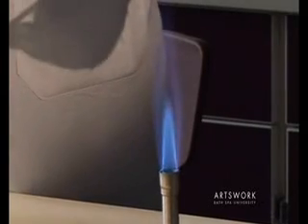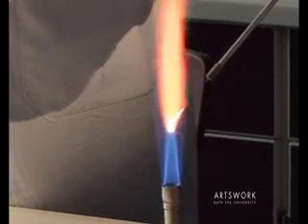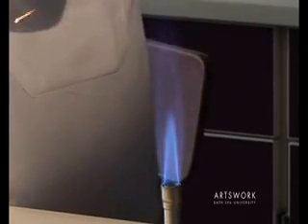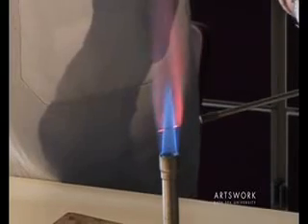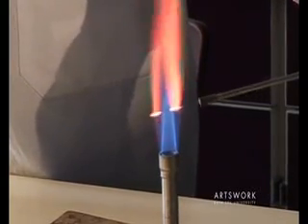If you're using the flame to sterilise equipment, put it directly into the top of that blue cone and almost instantly you can see the metal loop has become red hot. If you put the loop too low in the flame, you're only sterilising parts of the loop at any one time.